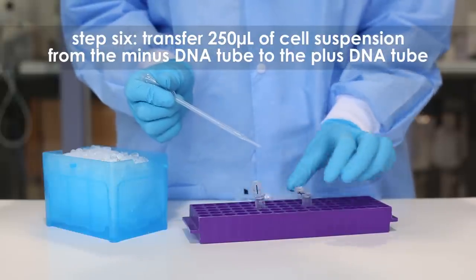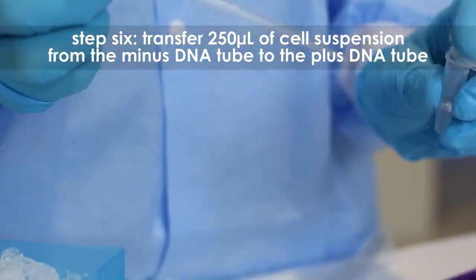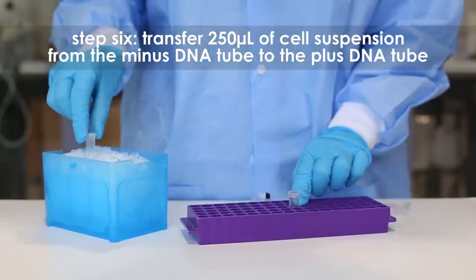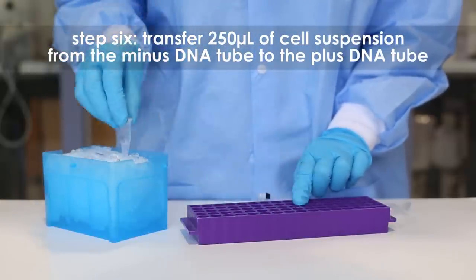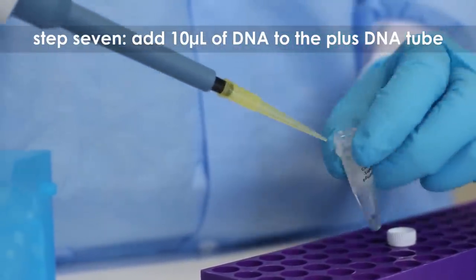Step six: transfer 250 microliters of the cell suspension from the minus DNA tube to the tube labeled plus DNA. Place the tubes on ice.